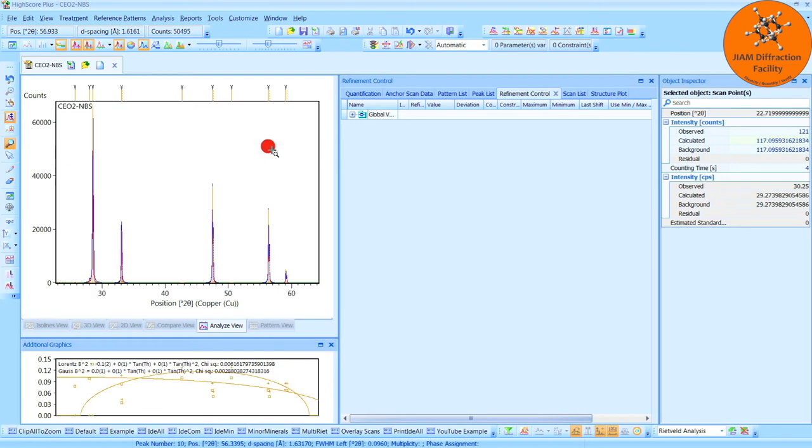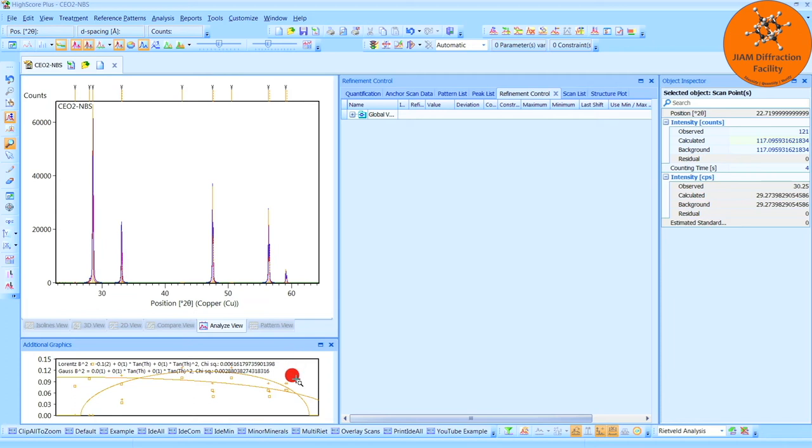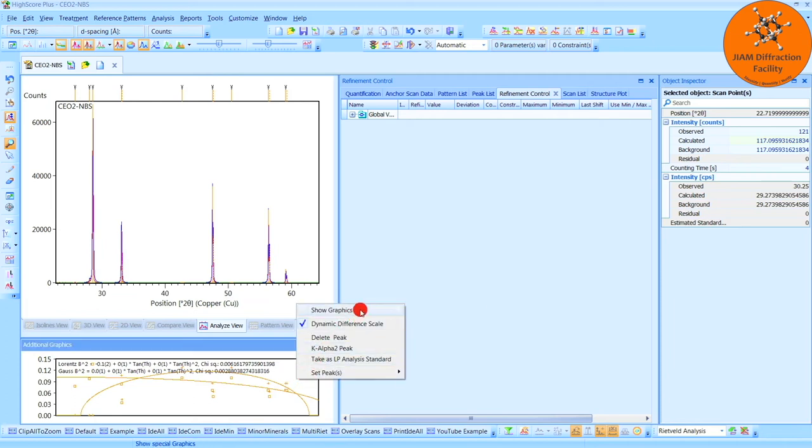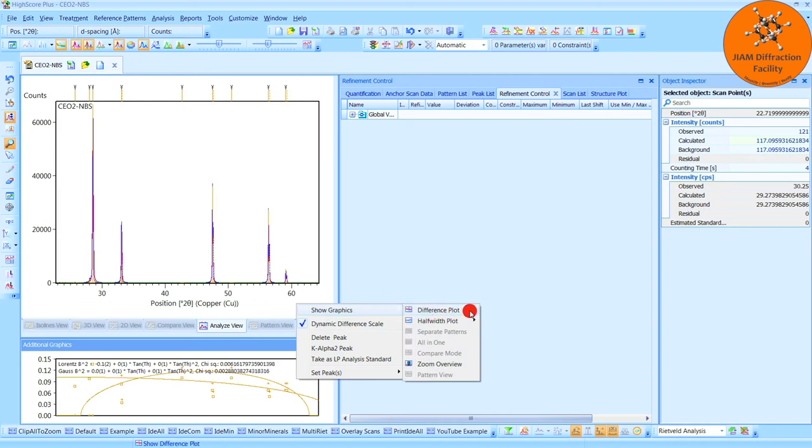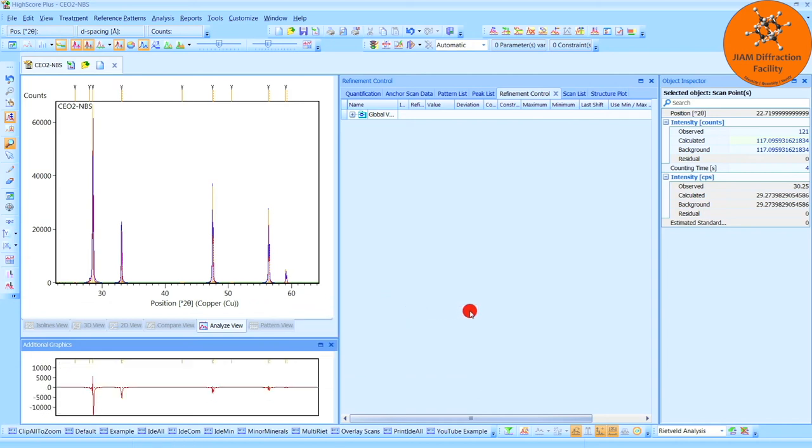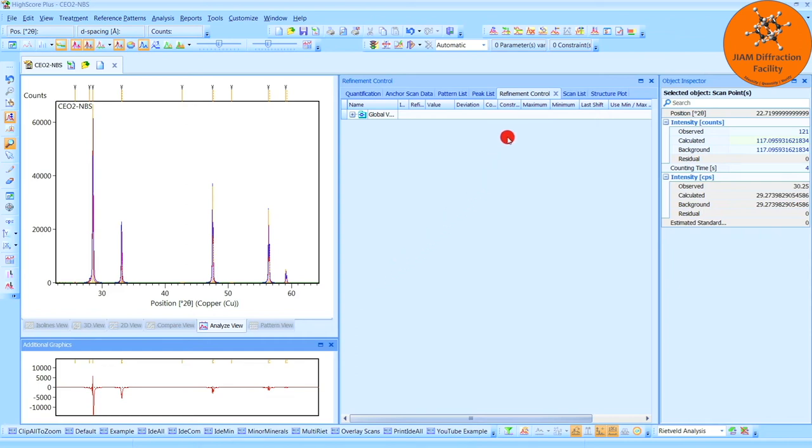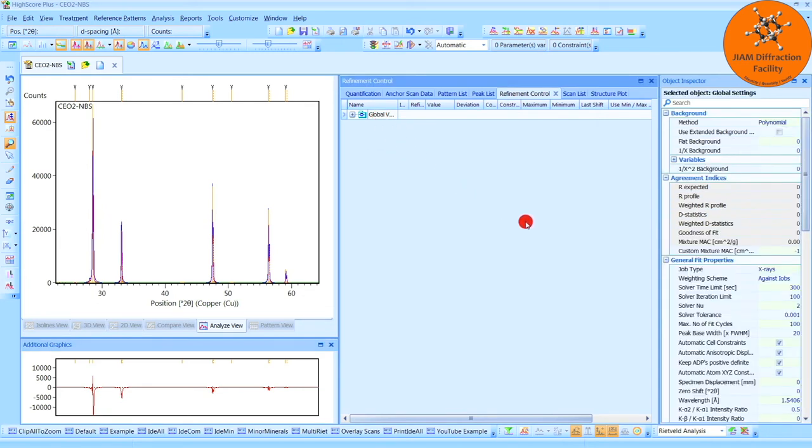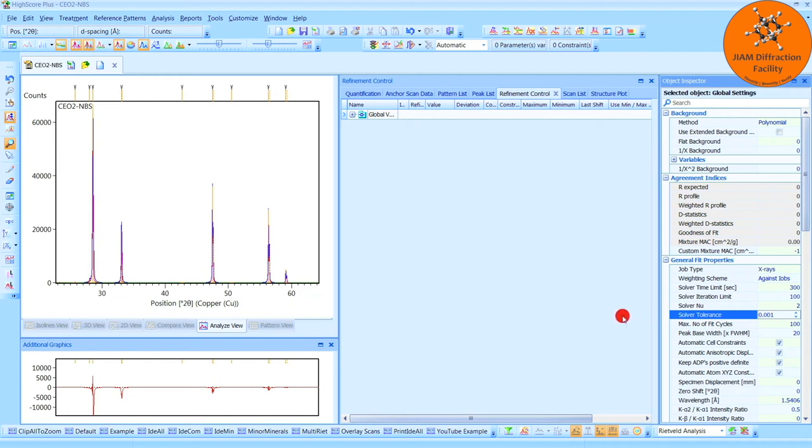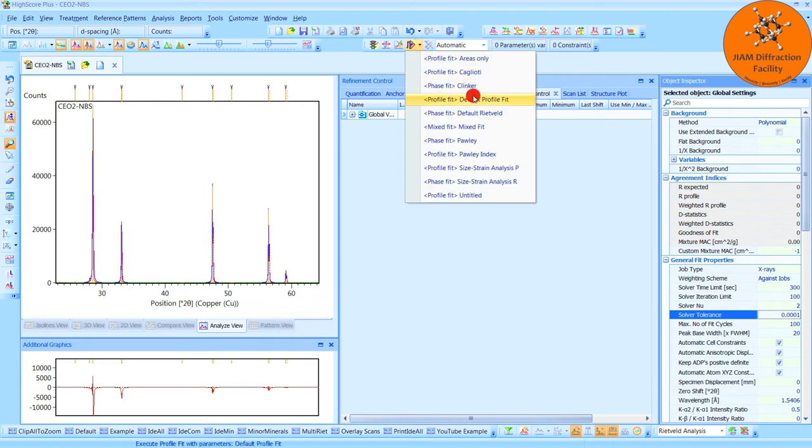And before I begin refining anything, I will do a couple of things. I will come down here to the additional graphics window, right-click, show graphics, and then difference plot, left-click. Here we see the difference between the blue and red curves. We want that to be as small as possible. In the refinement control tab, I will left-click global variables, and then come over here to the solver tolerance and add one more zero to make it more demanding. Enter.